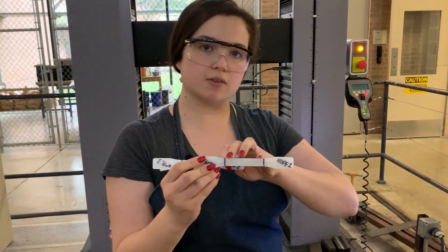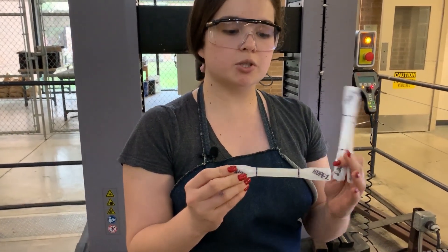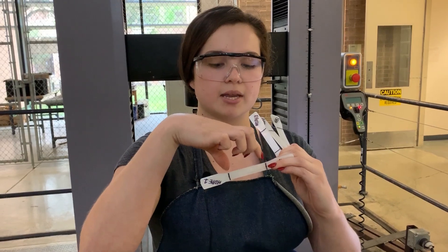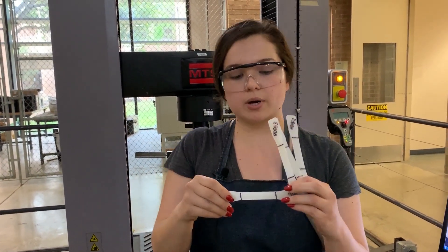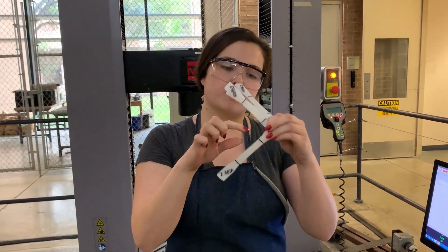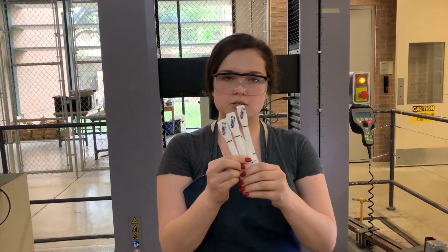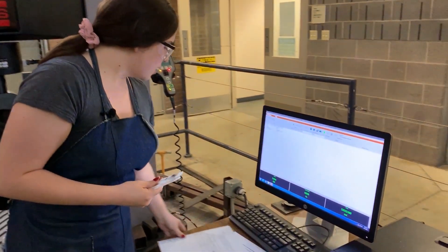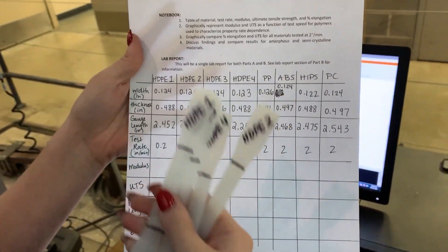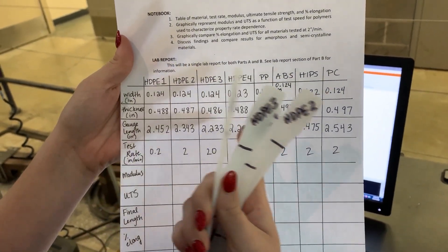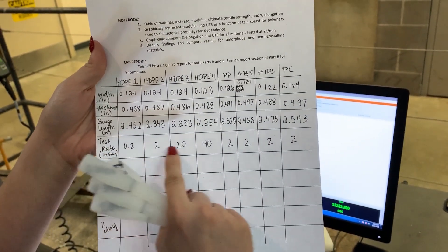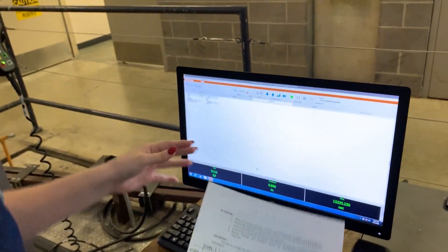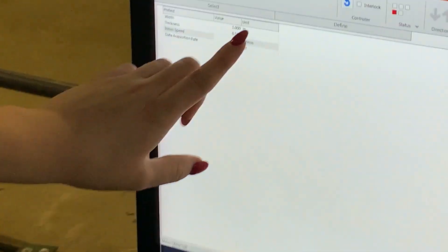I have labeled the gauge length on each of these. Once we pull these polymers apart, we're going to measure from this length to this length and find out how much elongation occurred. I have written down all of the dimensions for each specimen: HDPE one, two, three, and four, polypropylene, ABS, HIPS, and PC, along with all the test rates.